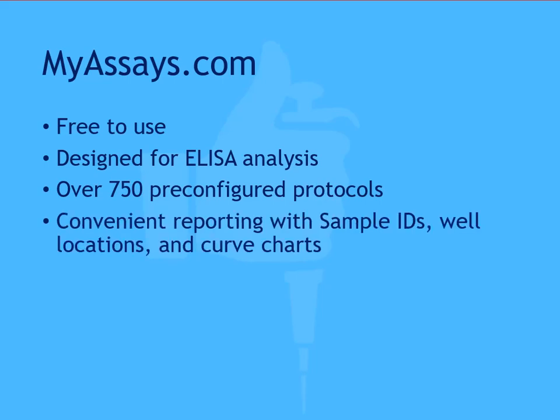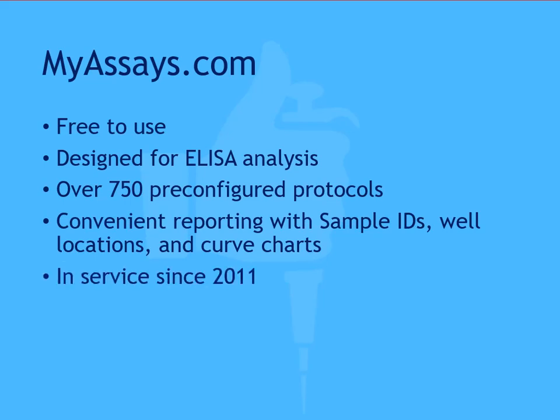The reporting available includes the opportunity to enter sample IDs for unknown samples and provides a clear progression from the well location and raw data through to the calculated concentrations. MyAssays.com has been in service since 2011 and is a tried and trusted analysis platform. I'll quickly demonstrate how to perform the same analysis we used ChatGPT for in MyAssays.com.